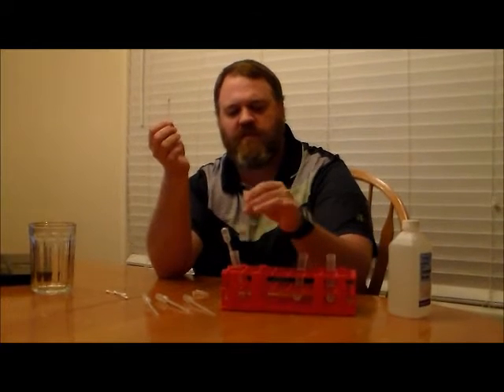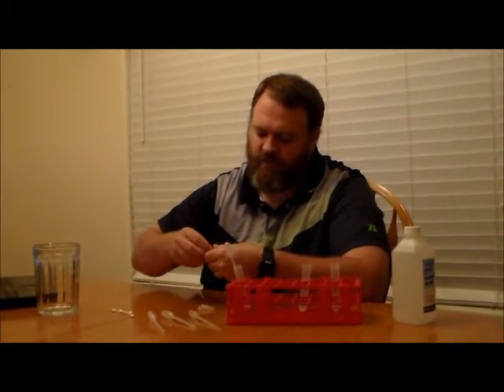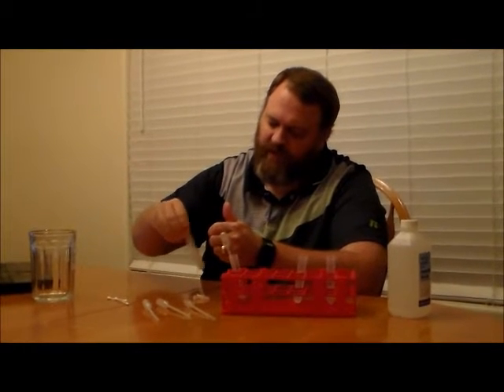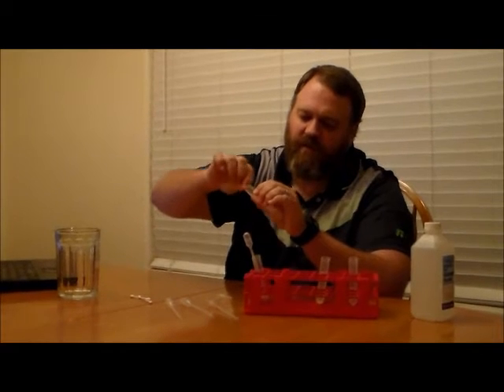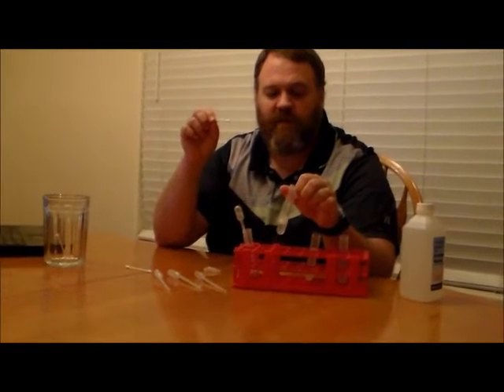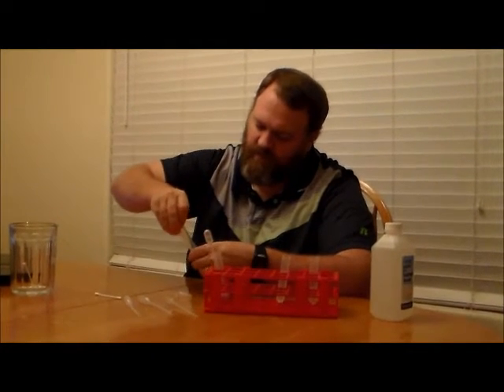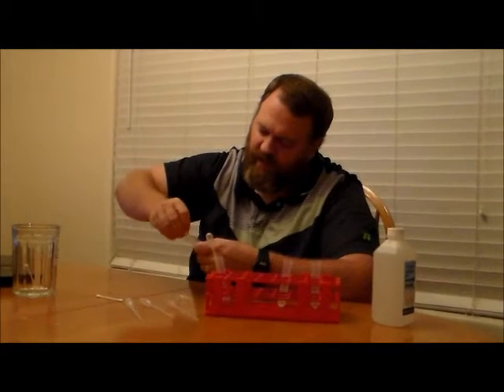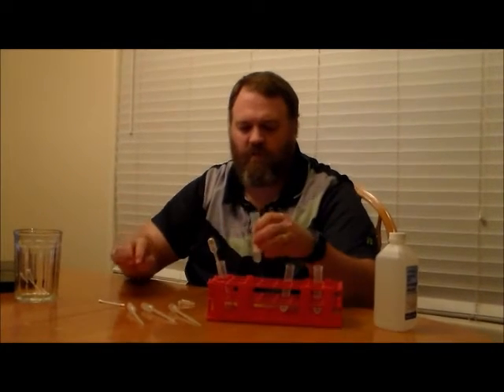Now on the end of the swab there are a bunch of skin cells, and I want to get those cells down into my solution. I'm going to take my cotton swab and swirl it around inside my solution to get as many cells to wash off as I possibly can. Then I'll squeeze the swab against the edge of the test tube to squeeze out any liquid. I'm going to do that a couple more times to get as many cells as I can, because that increases my likelihood of extracting good DNA.